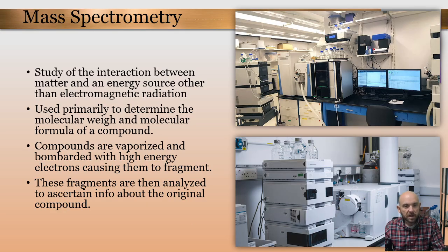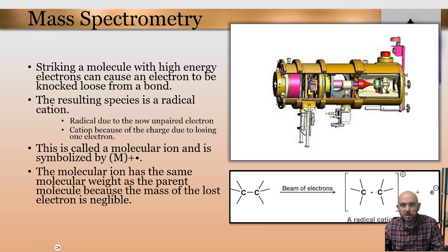So as I said, we'll move to that next slide, and we'll see in cross section that tube that was just sitting there behind me has a high tech array of different pumps and detectors and energy sources that generate high energy electrons, and it's somewhat like an electron gun in this enclosed tube.